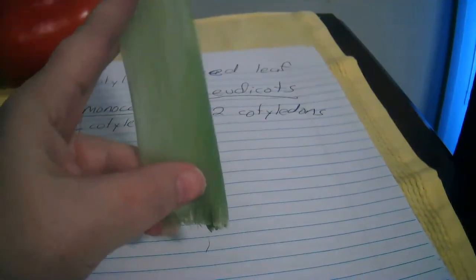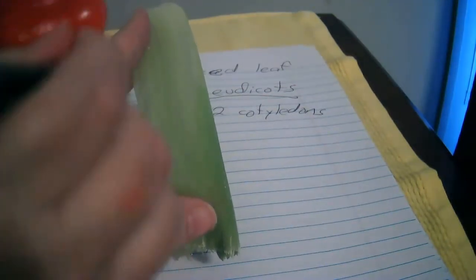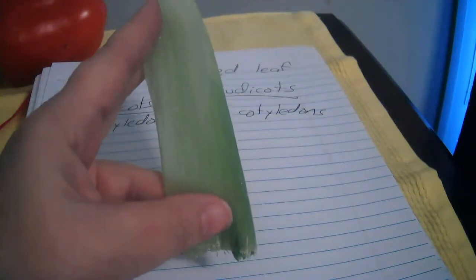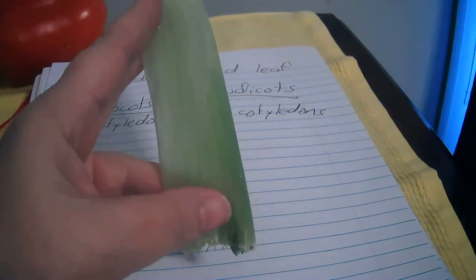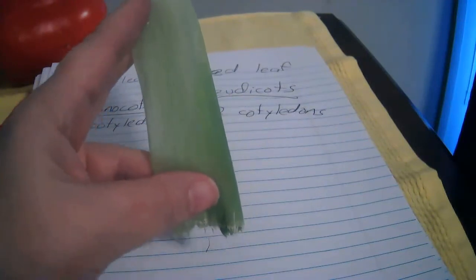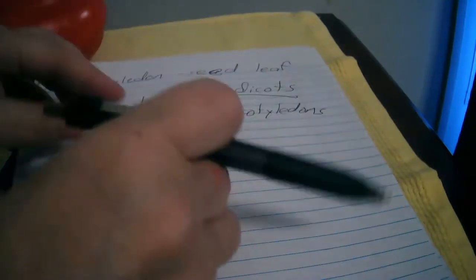See that the veins are running parallel from here to here. All of the veins in this leaf are running parallel. Now you can see it pretty good. Okay, so that is typical of a monocot, whereas I'll show you this one, which is going to be harder to see, but let's see if I can flatten it out.